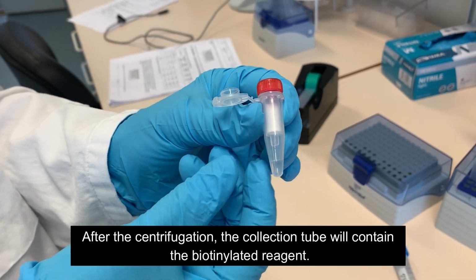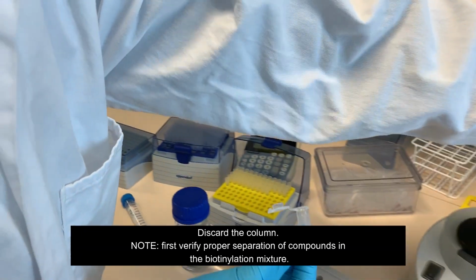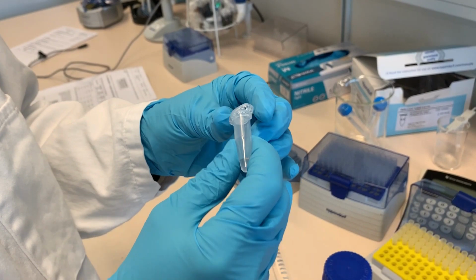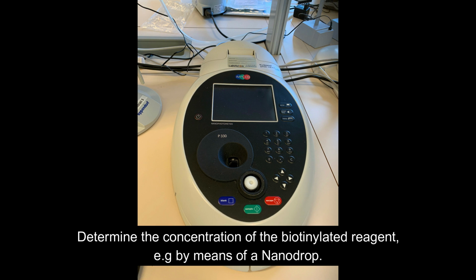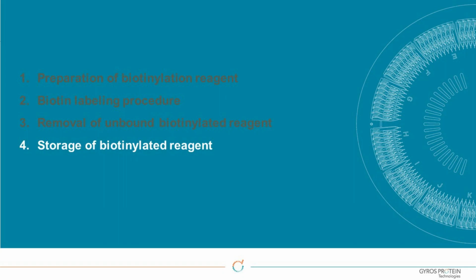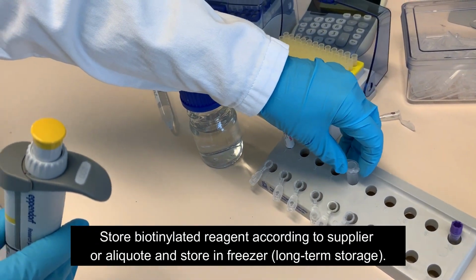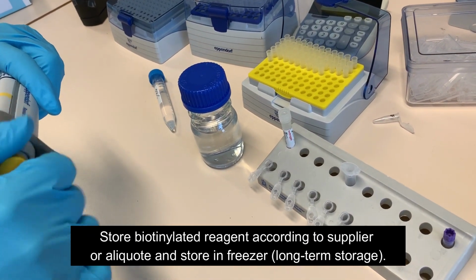After the centrifugation, the collection tube will contain the biotinylated reagent. Discard the column, but first verify the proper separation of compounds in the biotinylation mixture. Determine the concentration of the biotinylated reagent, for instance by means of a nanodrop. Store the biotinylated reagent according to the supplier's instruction, or aliquot and store in freezer for long-term storage.